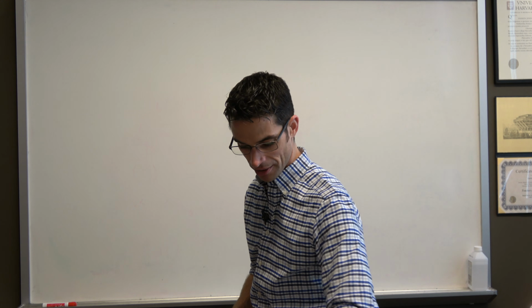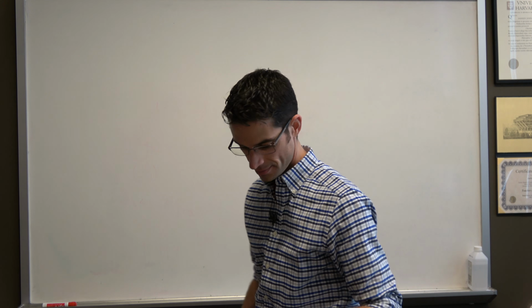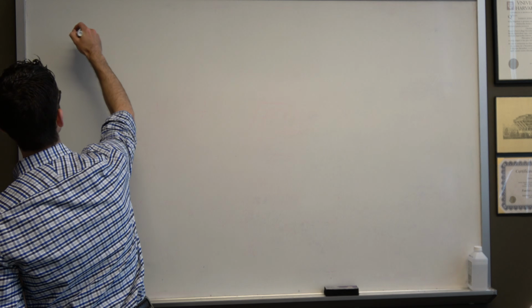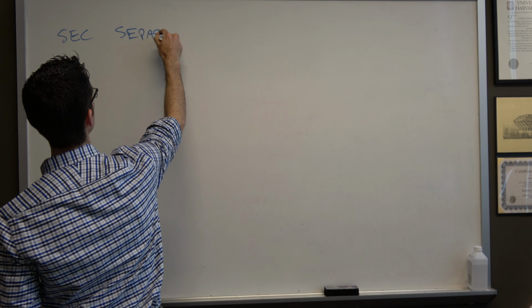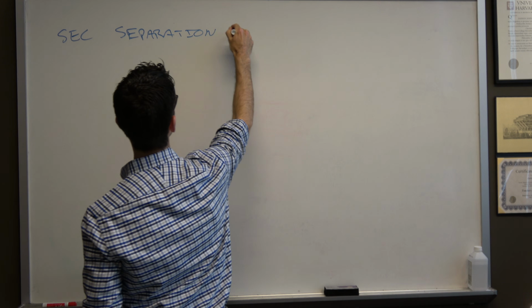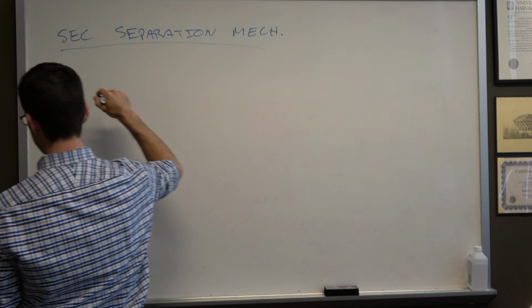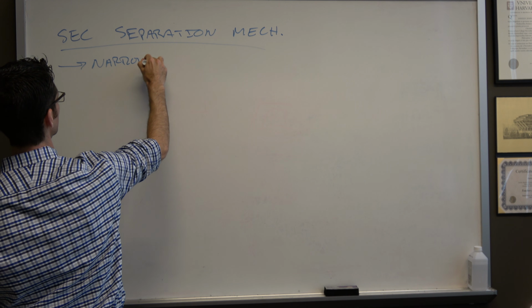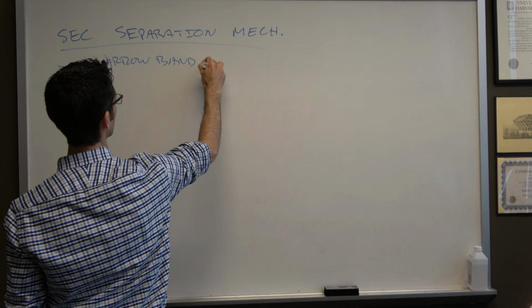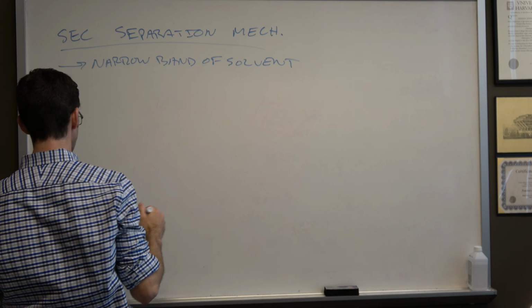So let's think about the separation mechanism in a bit more detail. SEC separation mechanism. Let's picture a narrow band of solvent entering the column.